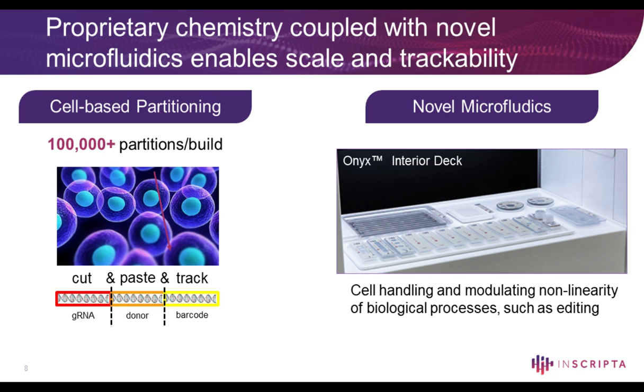So the second problem that you usually face when you're scaling up genome editing is consistent, reliable performance. A big challenge is the nonlinearity of biological processes that results in very poor coverage of designs or a very low fraction of edited cells in the library.